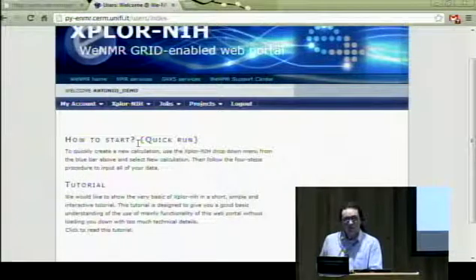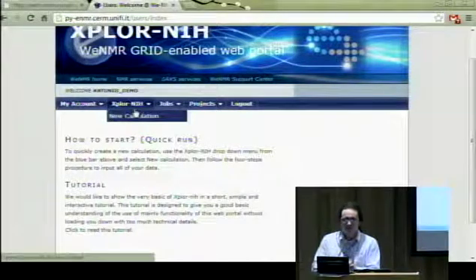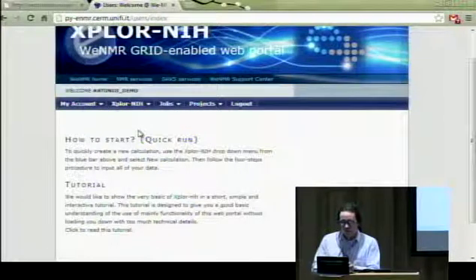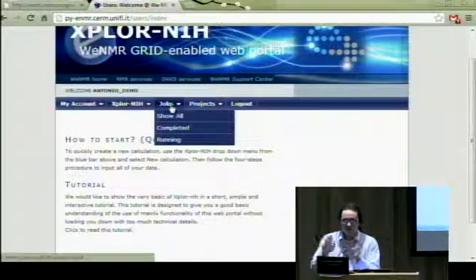Antonio, if they have the certificate and they try to log in using the certificate confirmation, do they get an error message now? I don't know, actually, I haven't tried, because I have problems with the single sign-on service. I can just go quickly through this, and then maybe we give it a try. I think that they probably disabled it, so it's not really doing the thing.